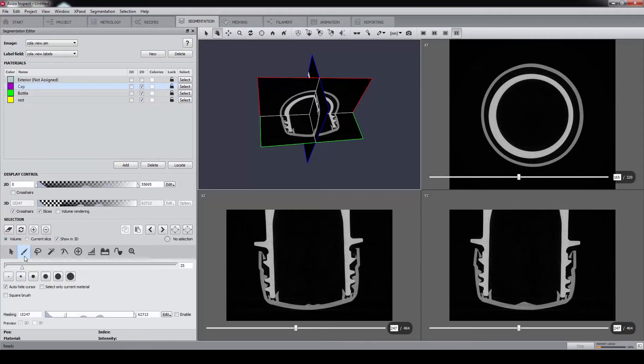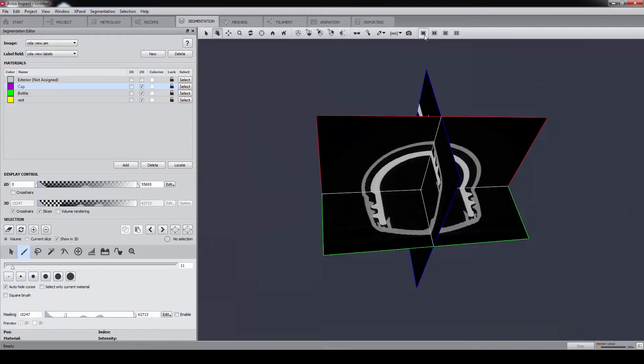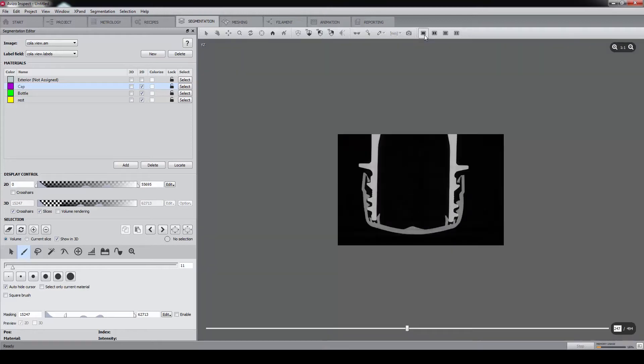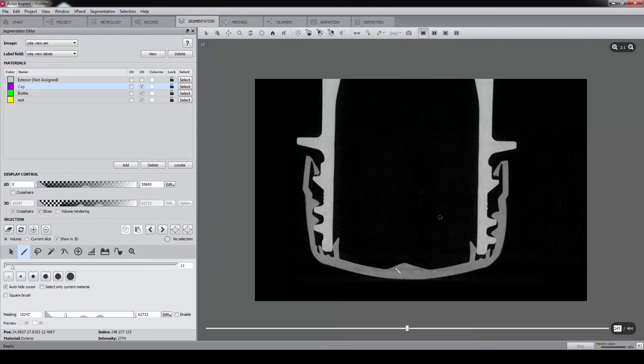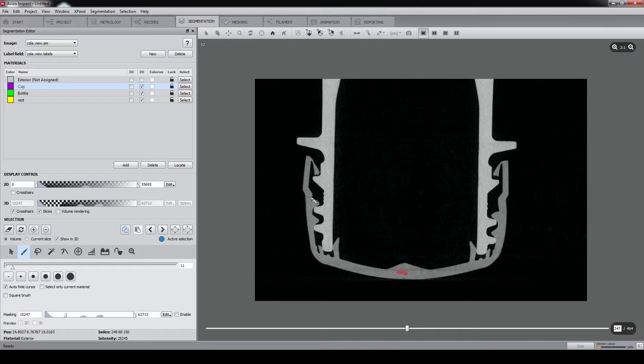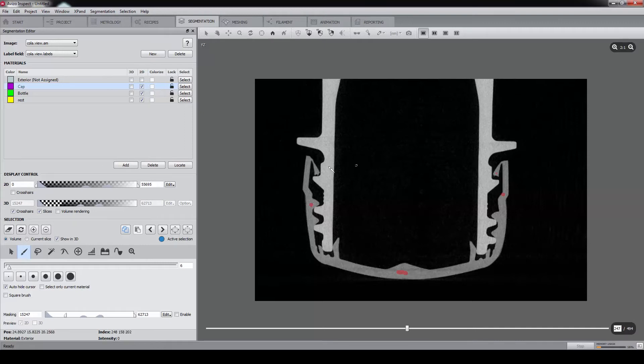For each of the materials, we define seed points with the brush tool. Switching to one viewer will make the selection easier to perform. With a smaller brush, we can even put seed points here. We switch the orientation again.